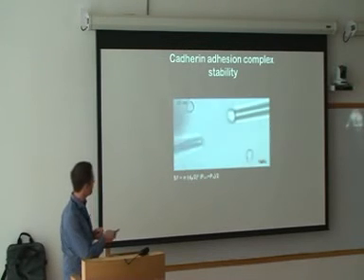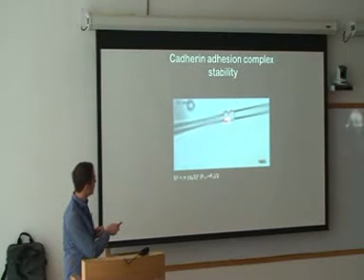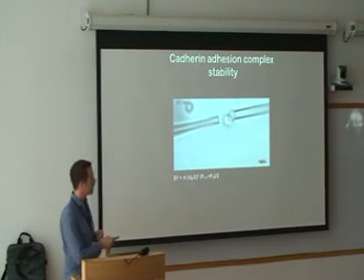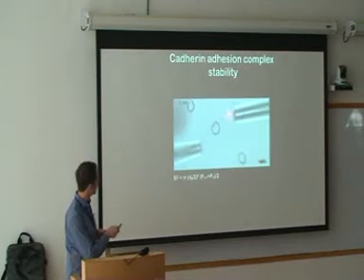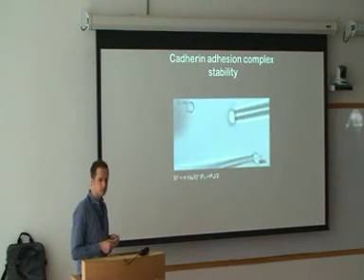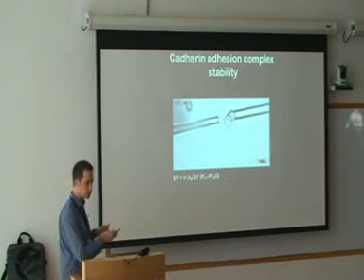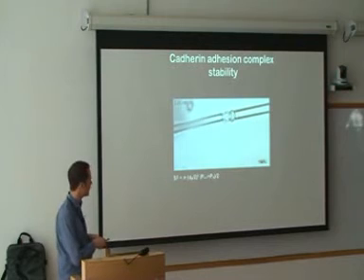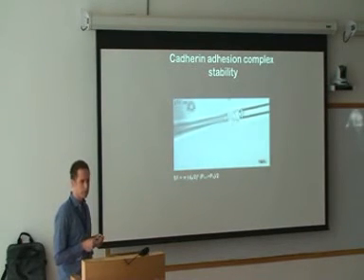I run this movie: you take a pipette, you hold one progenitor cell here, you hold another progenitor cell here, you put them together, then you wait for a given contact time that can range between 1 and 10 minutes. And what you do then is you go with this pipette and try to aspirate it into the pipette. You stepwise increase the pressure in the pipette till you reach a critical pressure where you can pull these cells apart. If you know the diameter of the pipette, and if you know the pressure between the last step, which was not efficient to separate them, and the next step, which was efficient to separate them, then you basically can calculate the force which is required to separate this doublet.